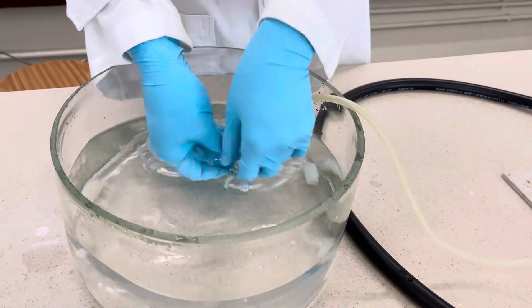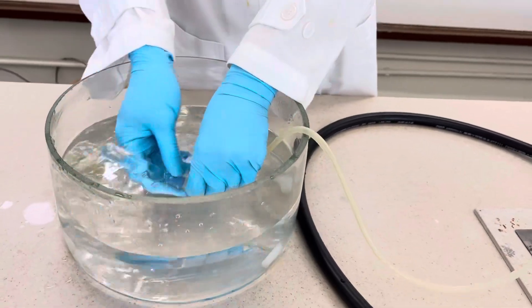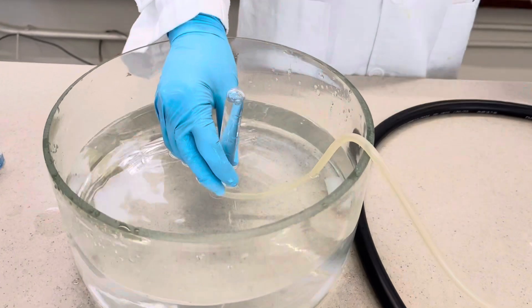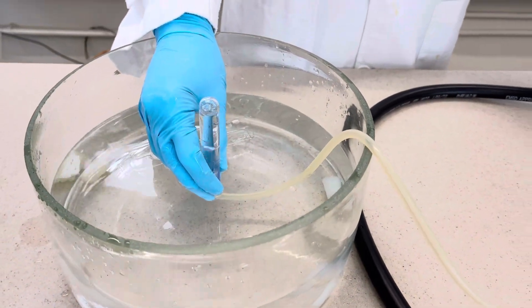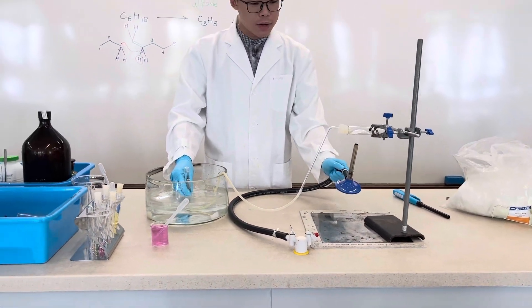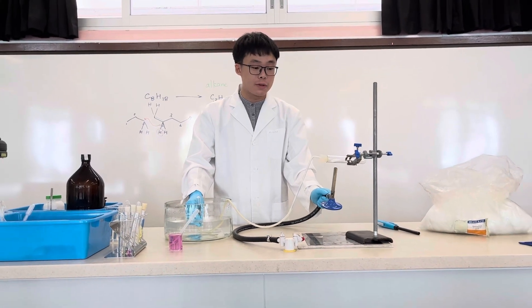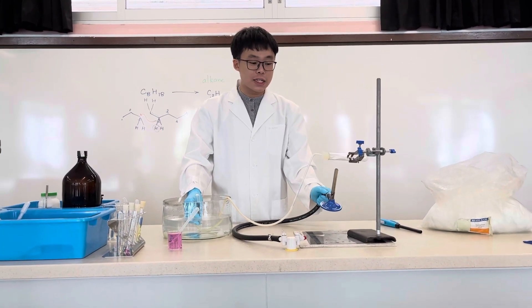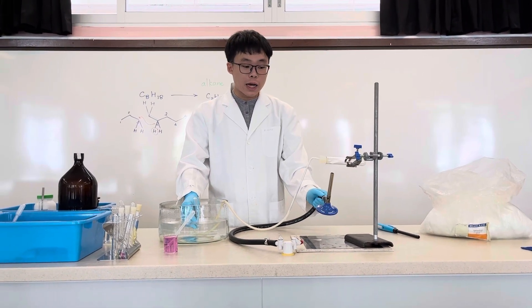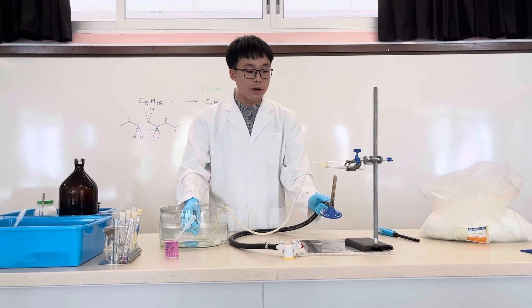We can now insert the test tube with the delivery tube, and you can see the gas is being collected. You can tell me why I heat the aluminium oxide and not the mineral wool soaked with medicinal paraffin — and also why I use aluminium oxide in powder form.